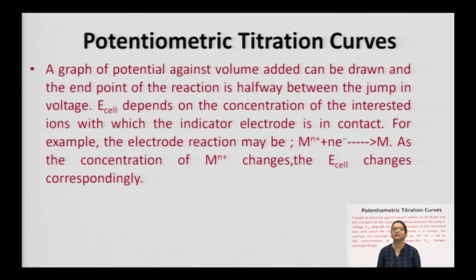तो जो भी हमारा potential changes होता है, जैसे जैसे titration proceed करता है, there are potential changes. As the reaction proceeds, there are potential fluctuations, voltage drop or voltage changes across the titration. We can easily plot them between the voltage drop or potential changes against the volume of titrant which is added from the burette. Okay. दोनों के बीच में हम ग्राफ प्लॉट कर सकते हैं.